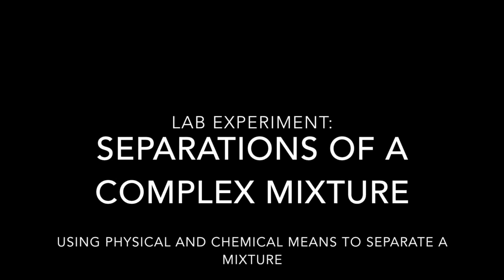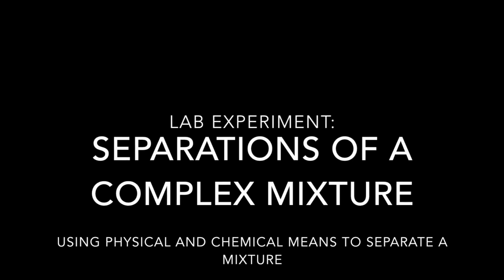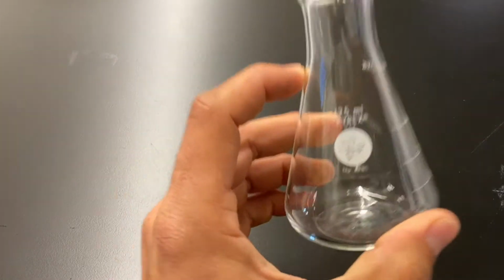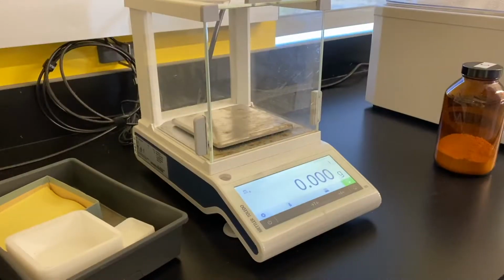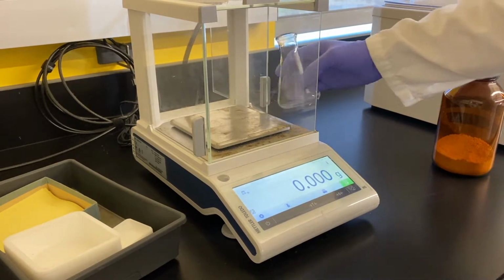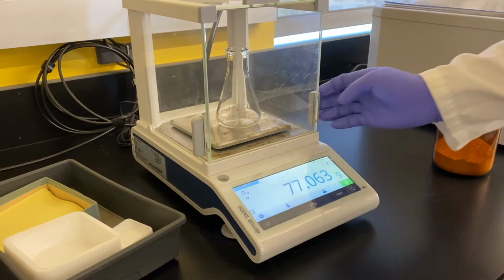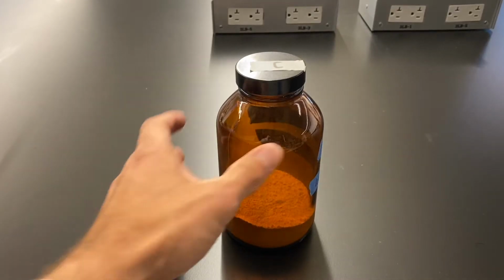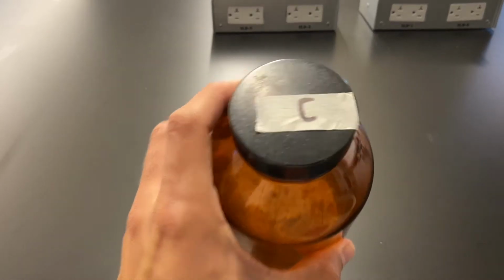Welcome to our lab. We're going to be separating a complex mixture, using physical and chemical means. In this lab, we're going to have a mixture that has sand, calcium carbonate, as well as some salt. And we're ultimately going to want to figure out what the percentages are of each of those in our mixture.